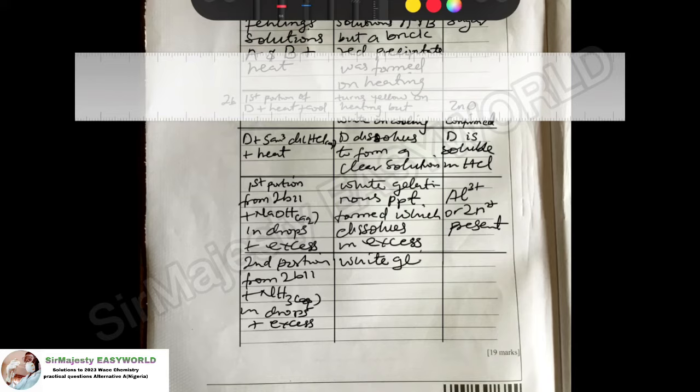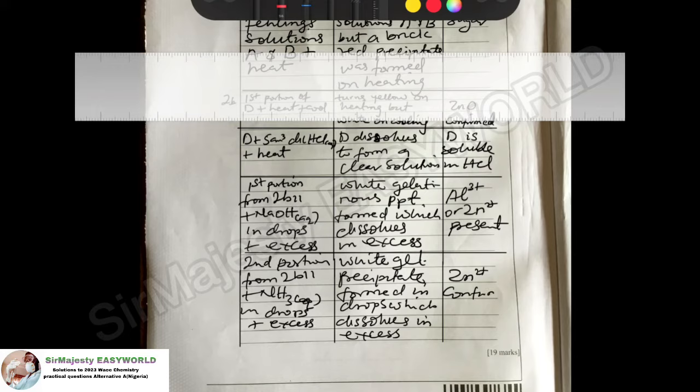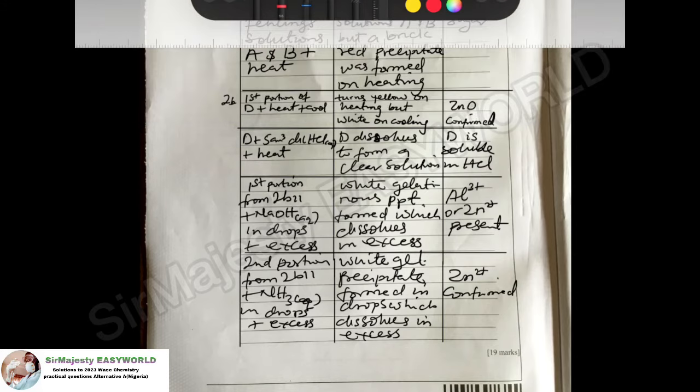White gelatinous precipitate formed in drops, which dissolves in excess of the ammonia. So inference is zinc 2 plus confirmed. So we are done with the salt analysis.